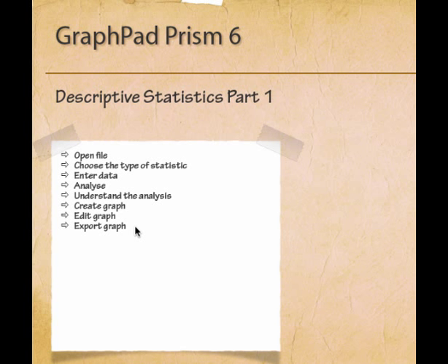So I hope this tutorial serves at least two purposes. One is to show you how to do descriptive statistics in GraphPad Prism, and give an overview of how to use GraphPad, and more importantly, that it inspires confidence in you that GraphPad Prism is a software that is user friendly.